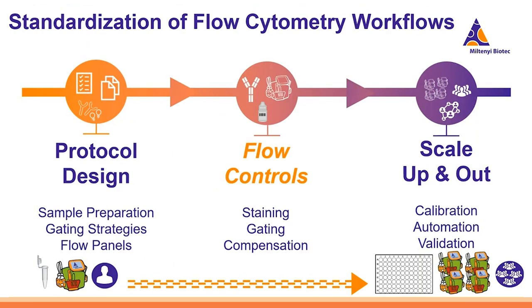So on to our next section. We have talked about protocol design and pre-flow cytometer things that we can consider to scale up our assays to give us standardized results. So now let's talk about some flow controls that we can run alongside our actual samples to help us with staining, gating, compensation, and a few other things.